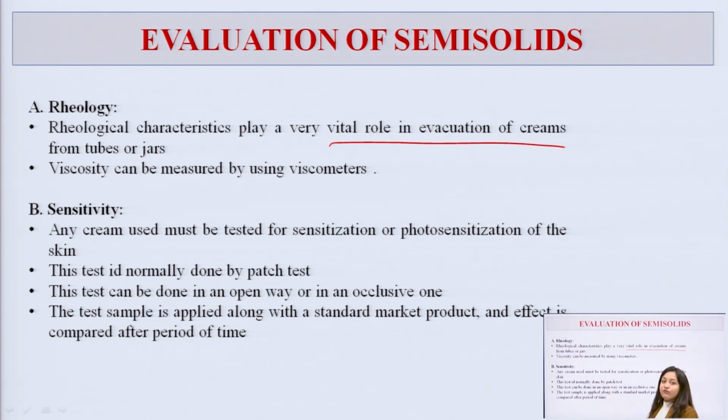Evacuation of creams or any sort of ointment is assessed by rheological testing. Viscosity can also be measured by using a viscometer if we want to analyze the presence of a viscosity enhancer, or how viscous our preparation was during formulation, after formulation or after its entire shelf life. These are some of the tests done to evaluate creams.